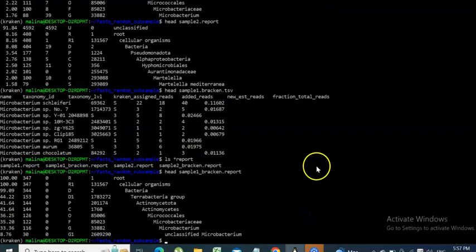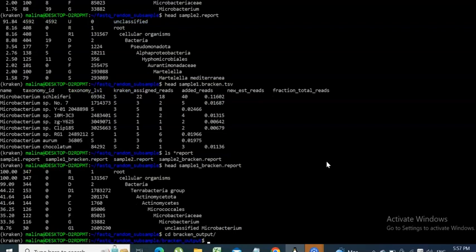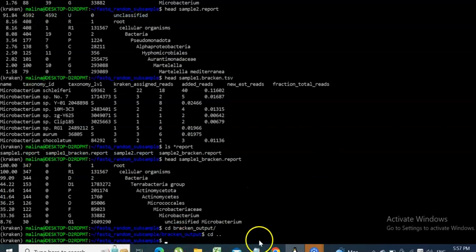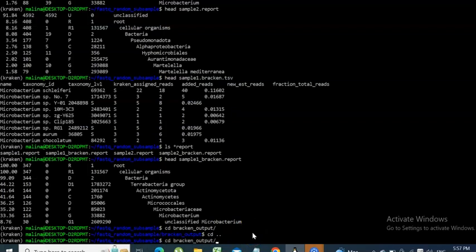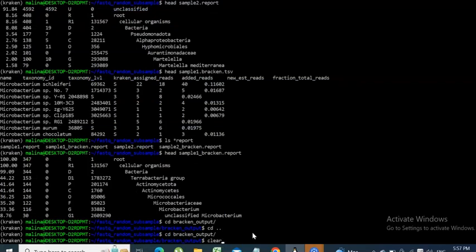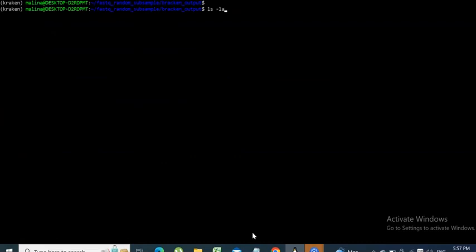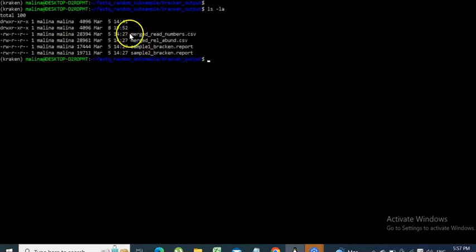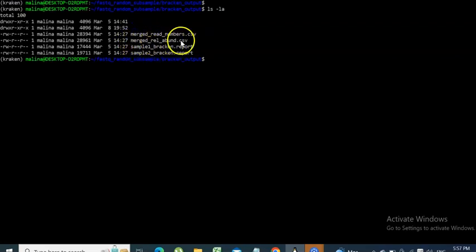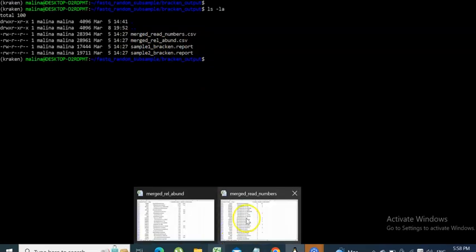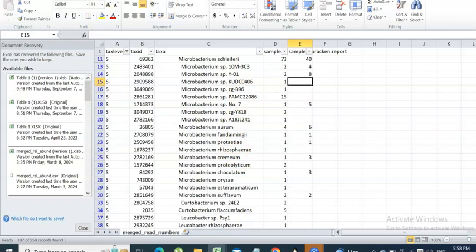Go into the bracken_output directory. Note that you need to run this script from your working directory, not from inside the bracken_output directory. Once you have run it and navigate to bracken_output, you will get two output files: one called merge_reads_numbers.csv and one called merge_relative_abundance.csv.